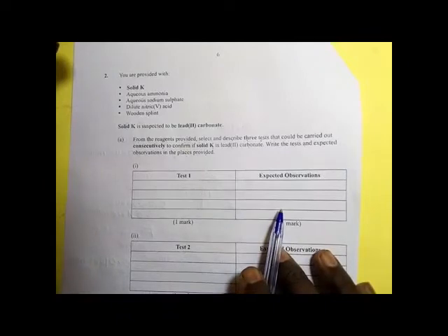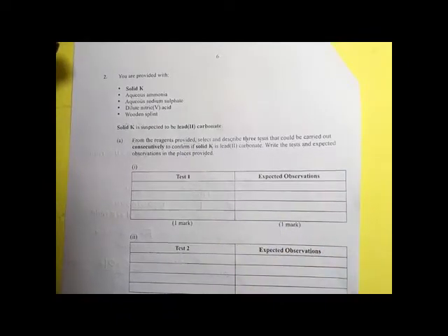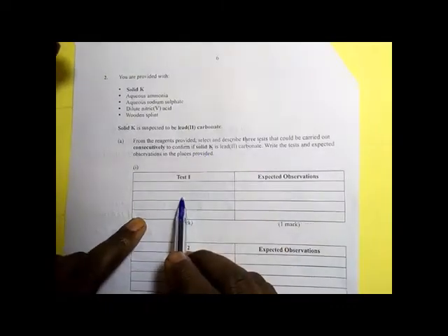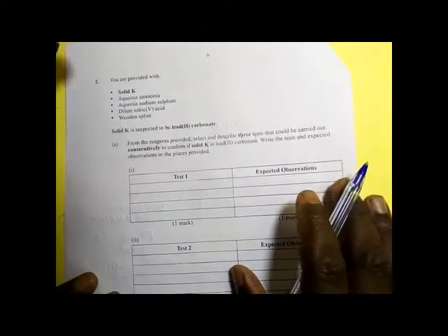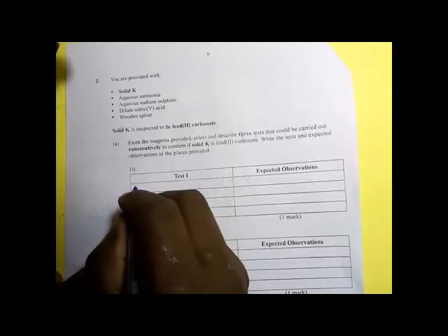So the first thing you want to do is to test whether indeed when you add acid to the solid provided, it will give effervescence. If it will produce effervescence, then you are likely to say, yeah, this one could be the lead carbonate.